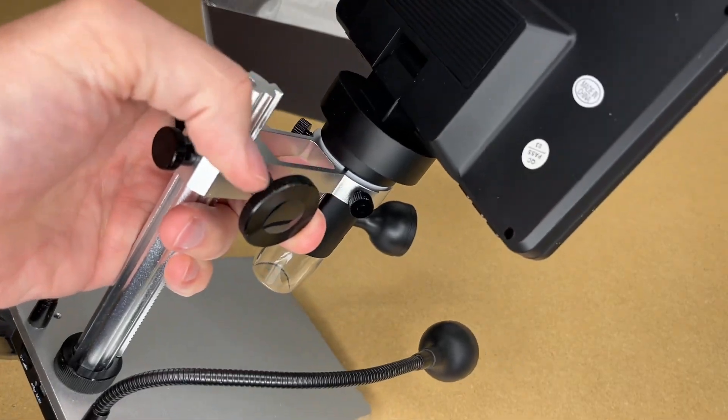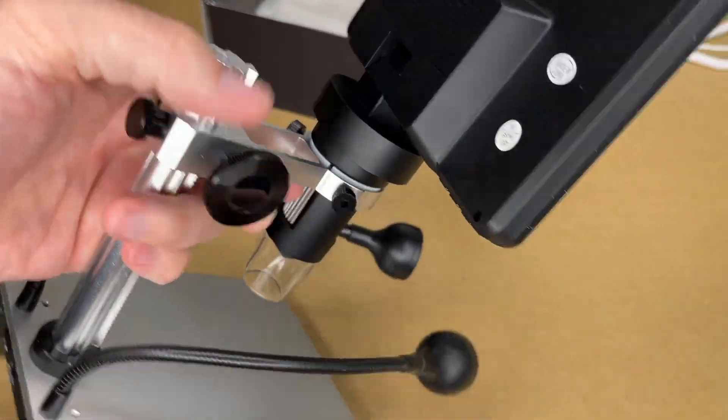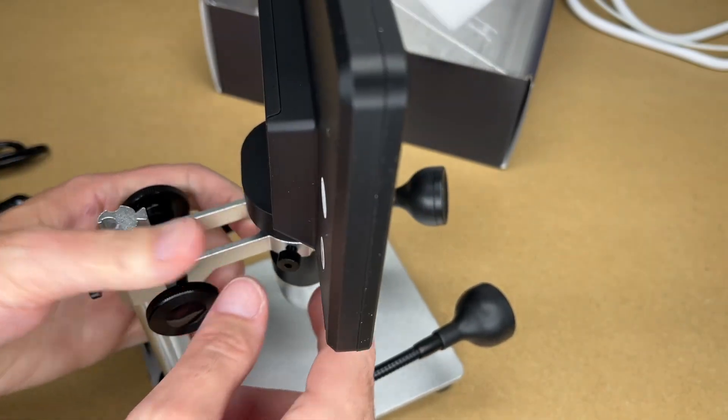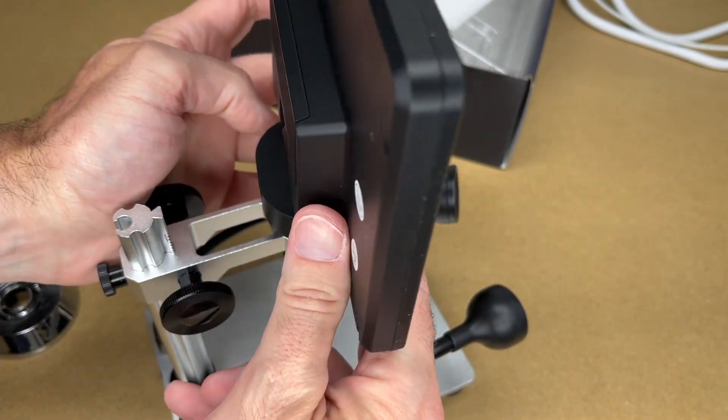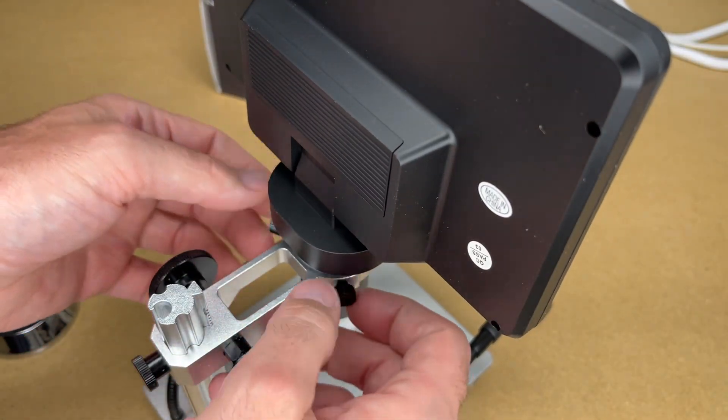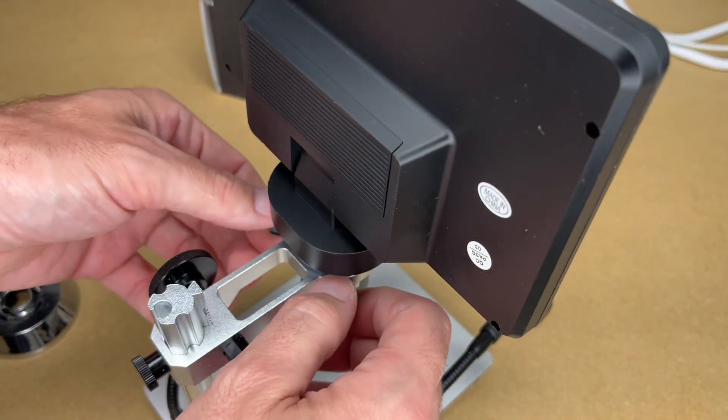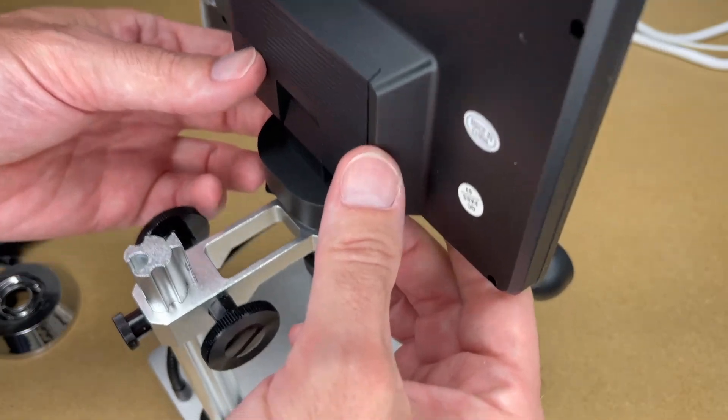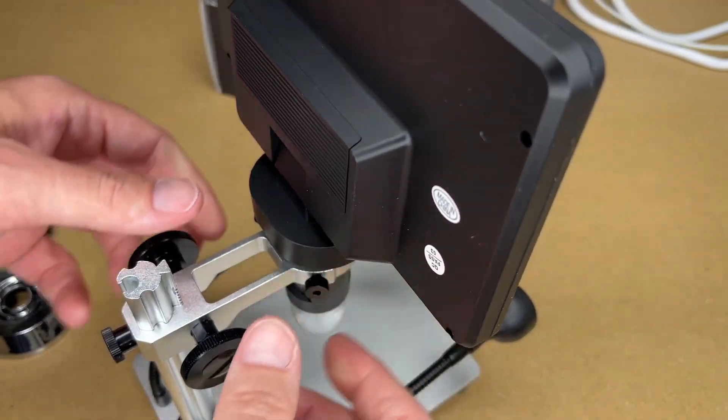That's nice there. So you can see it's not bunched up anywhere. So I'll rotate it till it's straight and now I can tighten these here. Shouldn't have to tighten these very tight. I'm sure I can lift this up now. Yeah. So this screen will pivot.